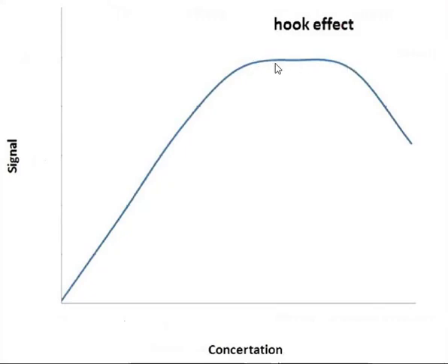But as you see, there is a straight line and it's flattened because the concentration is roughly constant, and you can't get any different concentration in this area. After this phase, the phase which is called hook effect, the analyte is much higher than the binding capacity of the capture, and also this time detector antibody.